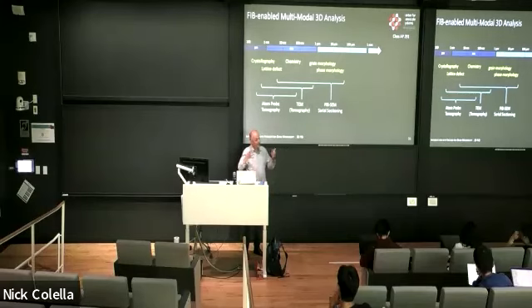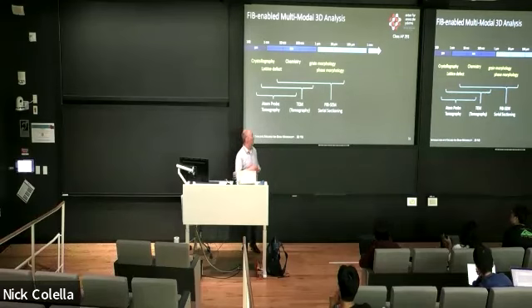And it turns out that this kind of volume range is interesting for many applications. So we use it for battery work, for fuel cells in the material science side.